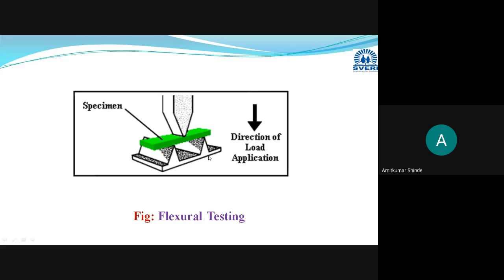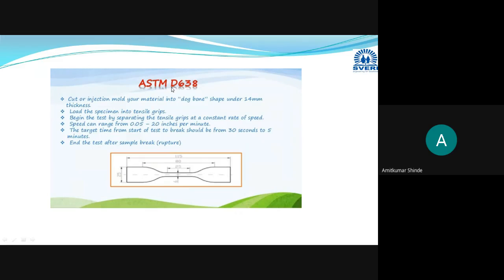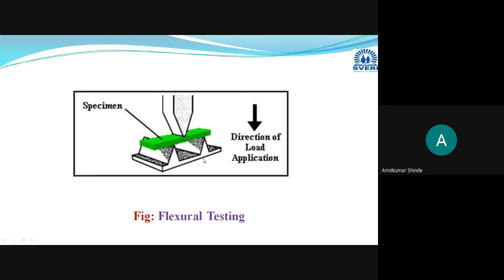Now this flexural testing is conducted here. The ASTM standard used is D790. For the tensile testing, we have used D638, and here we are going to use ASTM D790.